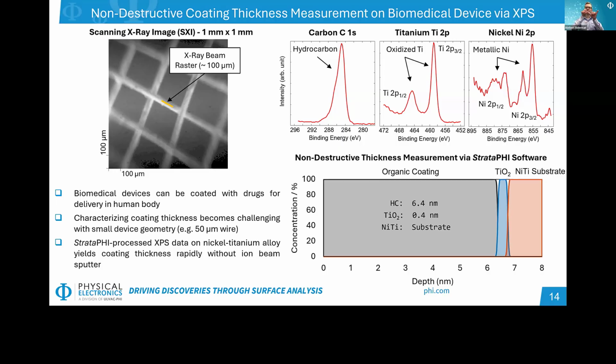So this non-destructive thin film measurement by XPS can be applied to various conductive and non-conductive materials in a variety of industries, including semiconductors, batteries, things of that nature. XPS will enhance the information of the depth profile of the sampling depth, and that is a tool called HAXPS, Hard X-ray Photoelectron Spectroscopy. We use hardened X-rays with a higher energy level compared to the softer X-rays which are used in conventional XPS.